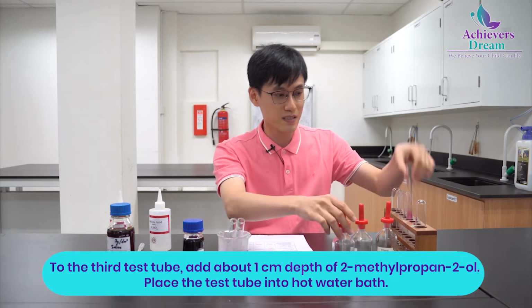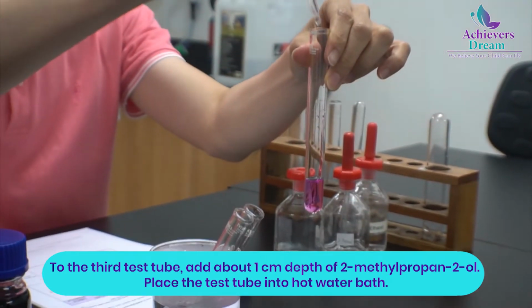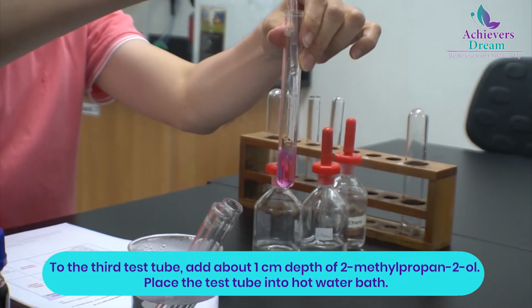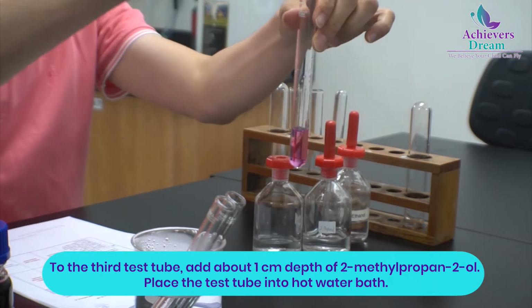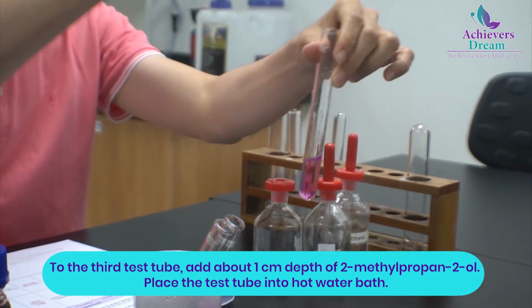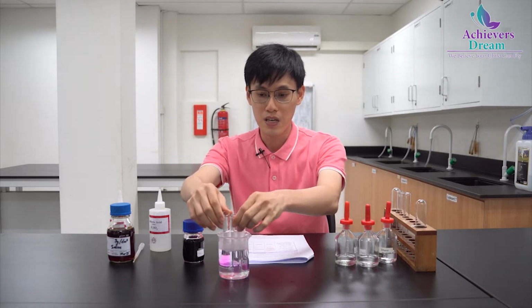And finally, a tertiary alcohol, 2-methyl-propan-2-ol. Tertiary alcohols are resistant to oxidation, so we don't expect to see decolorization of the KMnO4.